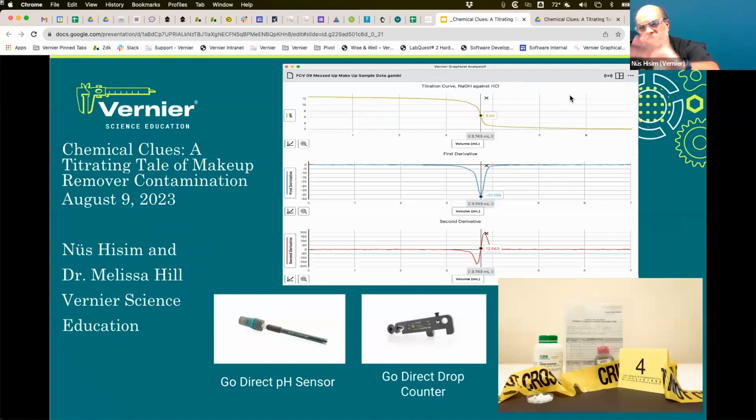You can see from the sample graph here, we're going to create this ourselves in a minute anyway, that it's going to start high, which is kind of unusual. Most of the time when you start out with titrations, you're going to titrate an unknown acid with a known base. Those two experiments from our advanced chemistry book are absolutely my favorite for teaching that, because the students learn how to standardize their base and then use that to find the concentration of an acid. But this one's going to take that and go to another level.